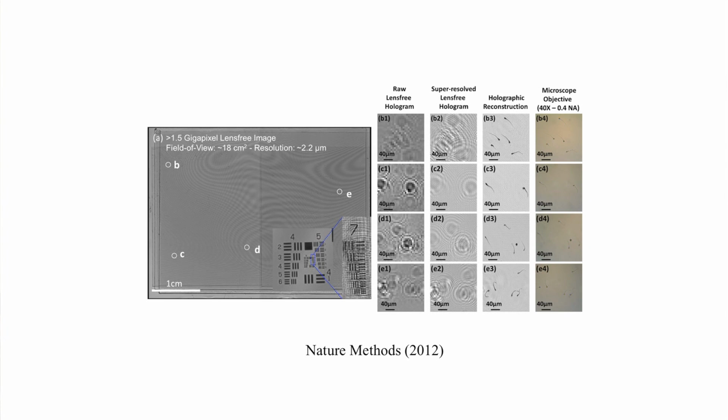And you see these submicron tails of the sperms here and their conventional microscope comparisons across a very, very large area. A microscope would be looking at this tiny white circle here with a similar resolution. That's where the throughput is great. But that's also an important point that I'd like to highlight here. That is decoupling between field of view and resolution.